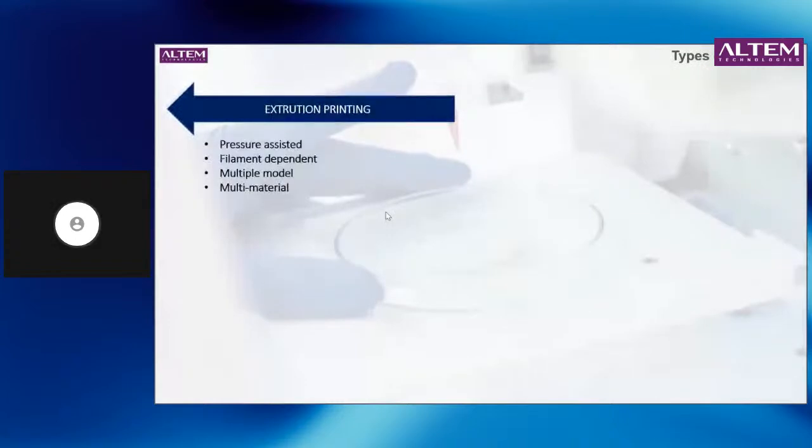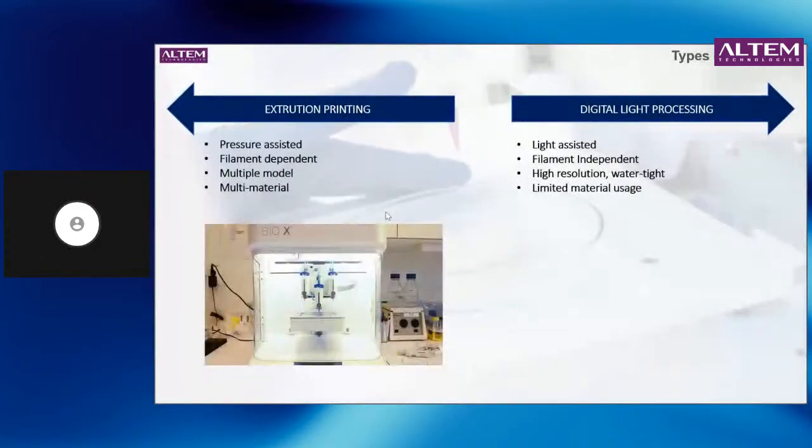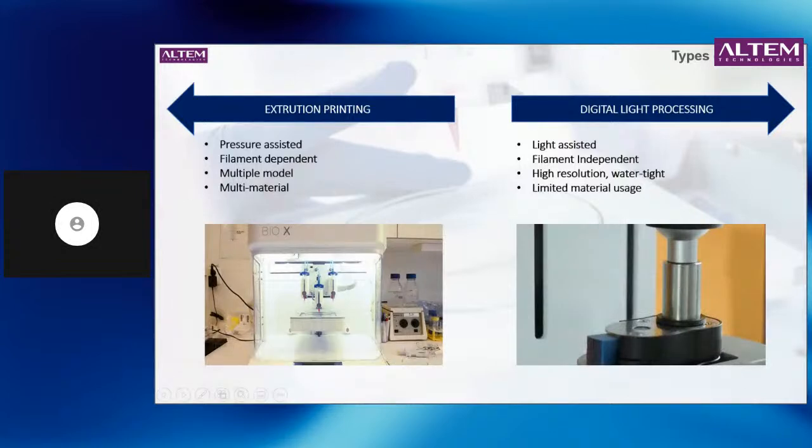And like I mentioned, we have the most widely used types of printers: extrusion based printers, digital light processing printers. A quick glimpse just for you to understand in case you've missed what extrusion printing is.